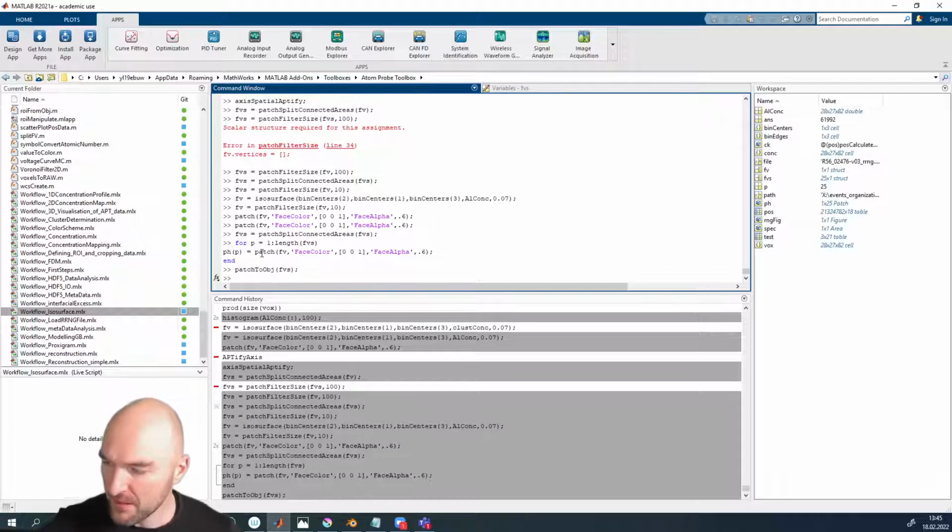And that's actually super simple. Okay, so the first thing we're going to do is we're just going to create a color variable which just creates a random color for each object.